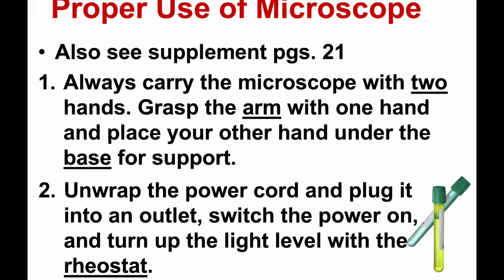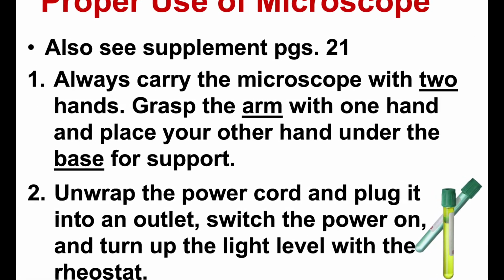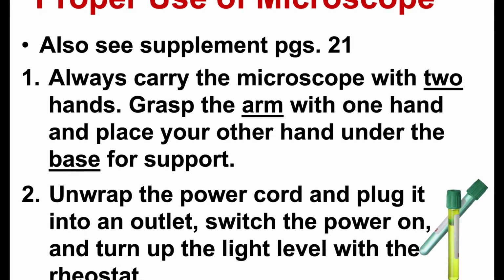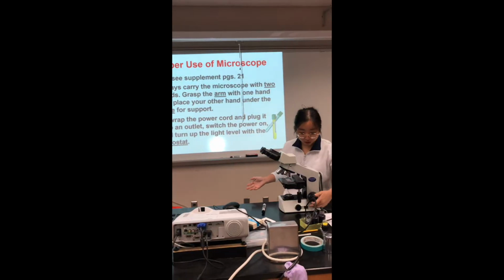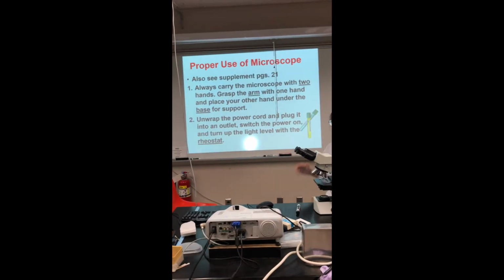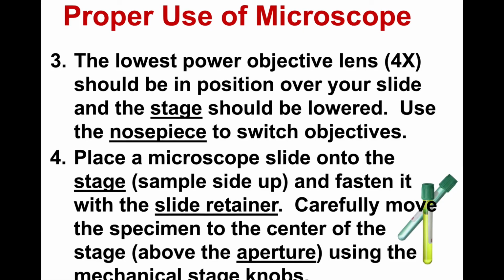Again, always use 2 hands to carry your expensive microscope, and unwrap the power cord and plug it into the outlet, switch the power on. You know the power is here, and turn up the light level. We use the rheostat as I showed you before.